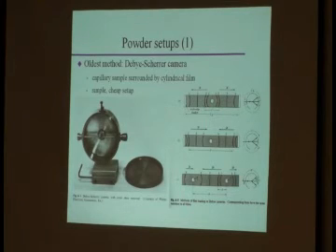And then you can measure how far your lines on your film are from the direct beam, which is your origin of reciprocal space, right? And you know the diameter of the cylinder, and you can do your math and you can figure out the d-spacings. Very straightforward, very annoying to have to measure that stuff, right? But they could do that, you know, 70, 80 years ago. Not a big problem.